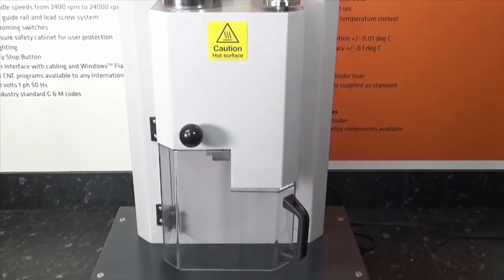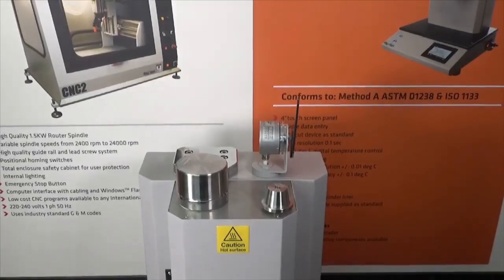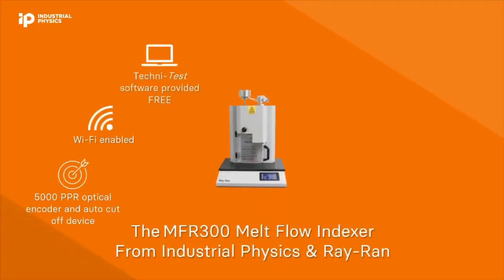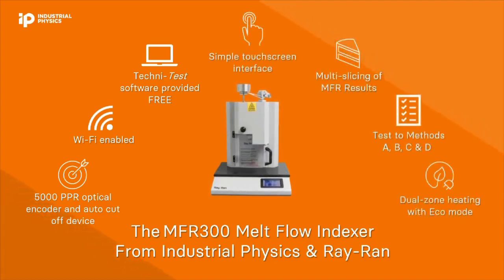MFR300 melt flow indexer from Industrial Physics and Rayran. The range-topping MFR300 is equipped with a 5000 pulse per revolution optical rotary encoder to cater for all melt flow testing requirements.